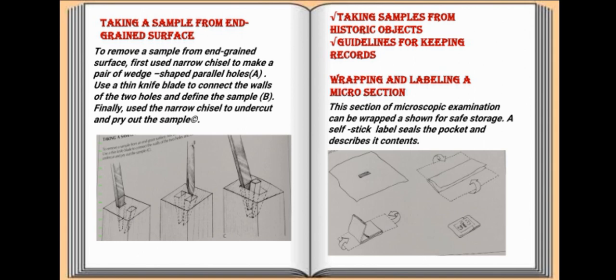Okay, taking samples from historic objects. Taking a sample from historic objects requires special care and attention due to their age, fragility, and cultural significance. The process must balance the need for analysis with the preservation of the object.